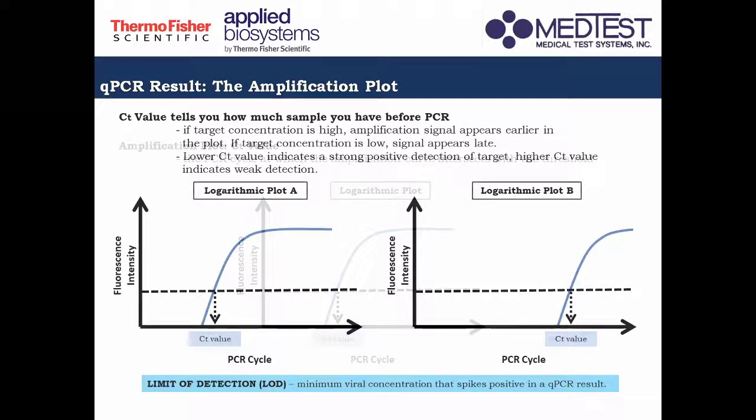So, ano bang importance nito? CT value will tell you how much sample you have before PCR. So, ano bang ibig sabihin nito?